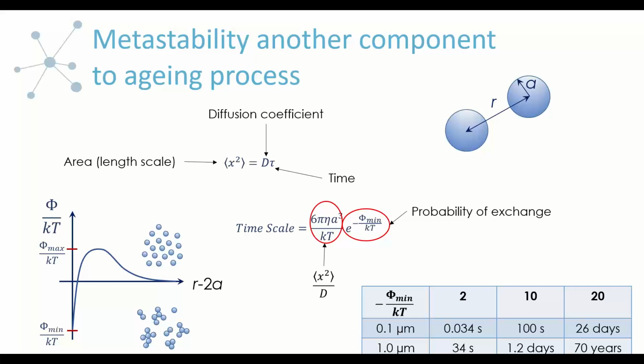So bear in mind that proteins have a non-uniform charge and attractive sites and are much more complicated. So diffusing proteins must interact with each other at long enough timescales where they interact in just the right way to induce an aggregation event. And whether this is a clustering or irreversible aggregates, that is completely dependent upon the protein in question as well as the formulation that you use. And this non-uniformity in proteins and protein formulation is yet another reason why protein aggregation and aging is complicated and a difficult to predict process.